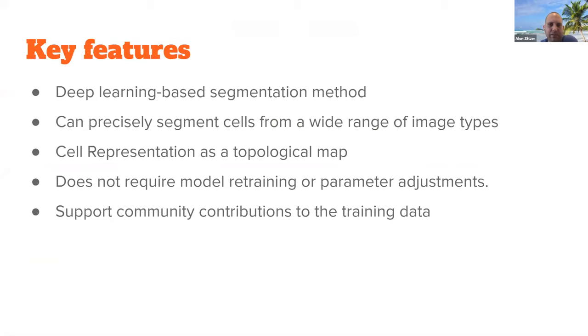So the key feature of this article, we're talking about segmentation, this is the whole context. This is a deep learning based segmentation method. It can generalize well for all sorts of different cells. The innovation in this article is that they are representing the cell as a topological height map, and Leon will talk about it. It does not require any model retraining or parameter adjustment, which is nice. And there is a community contribution of training data.